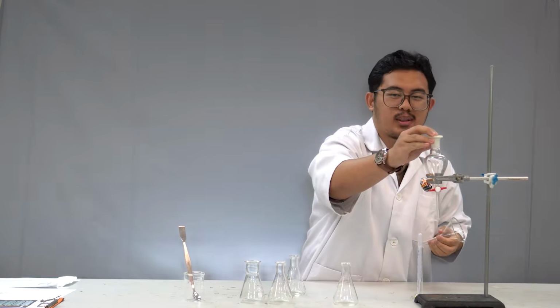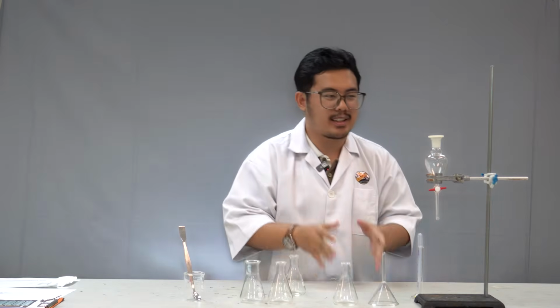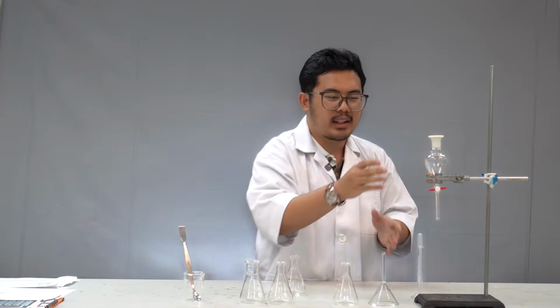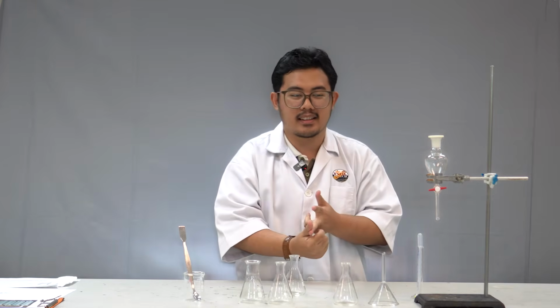So now, moving on to stage number 2. What is stage number 2? Stage number 2 is the separation of acid. Separation of acid. So how do we separate acid from a mixture of neutral, base, and acid?